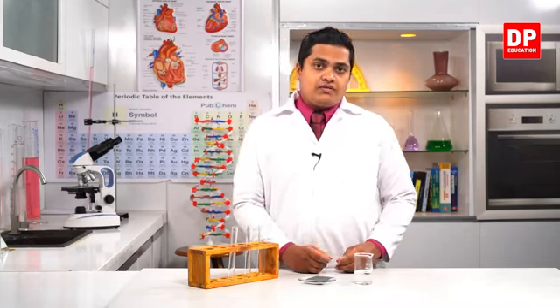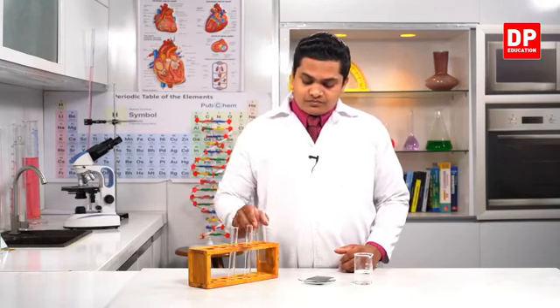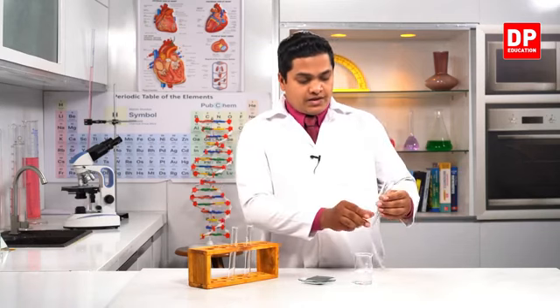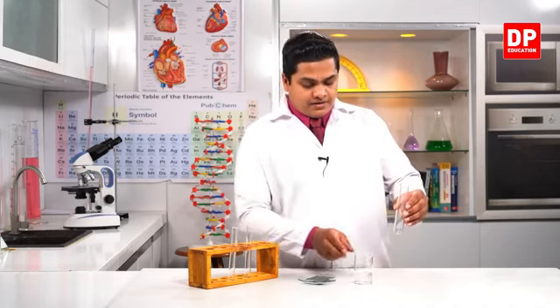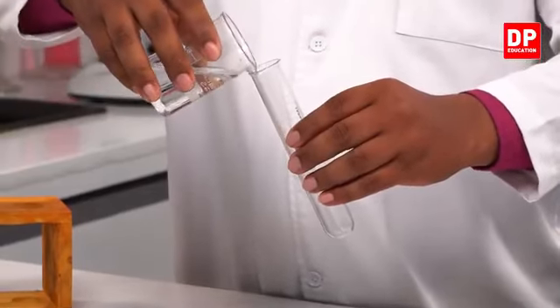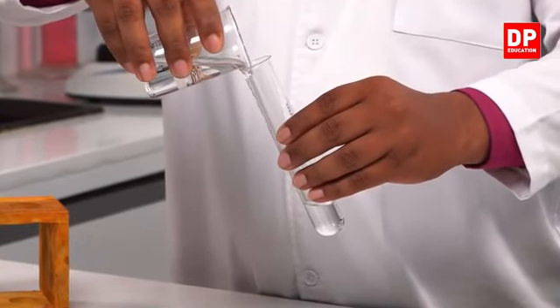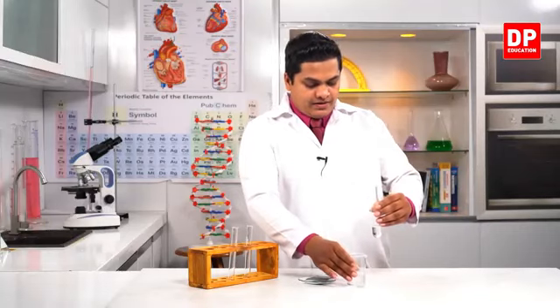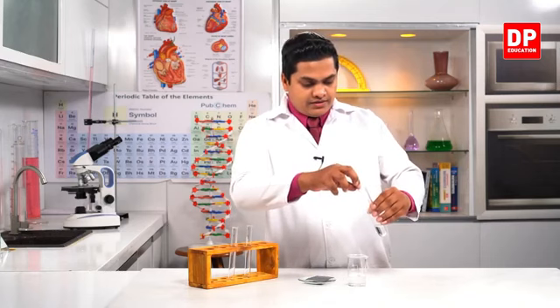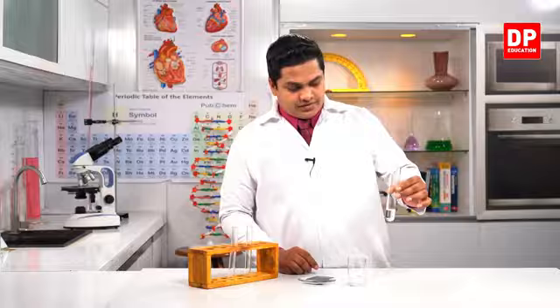So to get the observations more clear, I'm going to use a boiling tube. So I'll add some sulfuric acid. Then gently we'll add the zinc and let's see what the observations are.